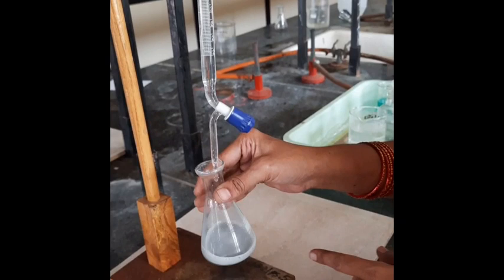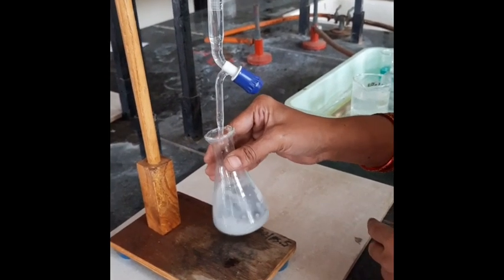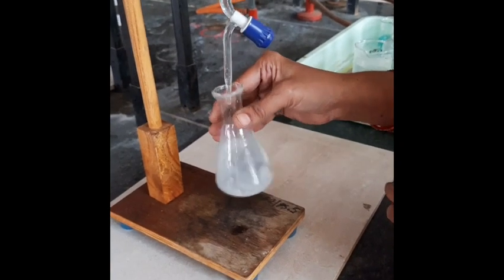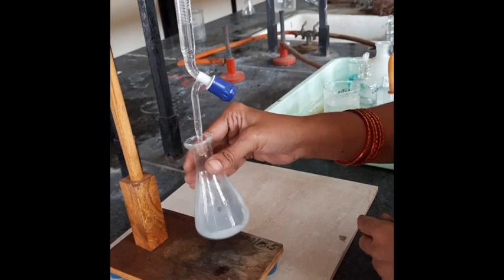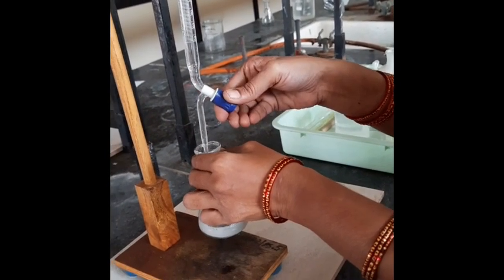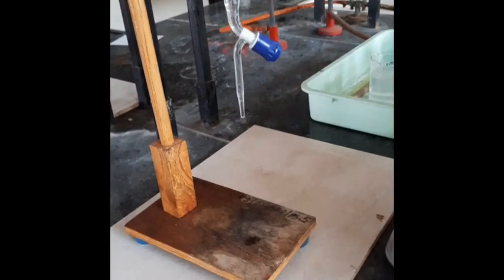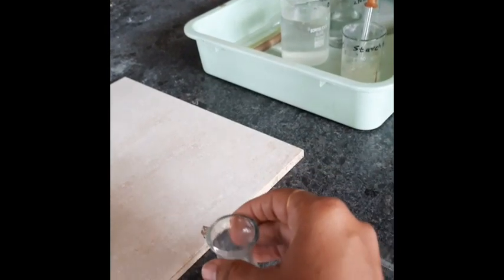So add a few more drops. See here, till light blue appears. Continue addition till the solution, that blue color, changes to milky white. Okay, now stop the addition and observe the color. In the beginning it is somewhat blackish, and you can observe the color is turned to white.